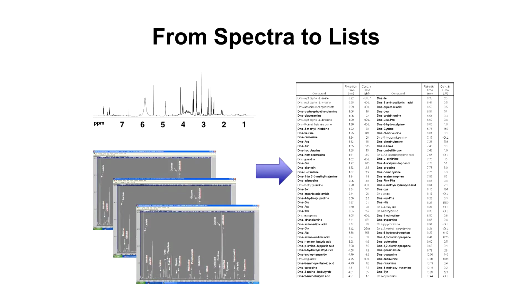So you can break down metabolomic analysis into sort of 4 steps, whether it's both targeted or untargeted. Typically, the first one with targeted or quantitative metabolomics, as I like to call it, is to go from spectra to lists of compounds. Now, it may be compounds that are identified, or it may be lists of features with their intensities. So if you don't know what it is, at least you can say it's a peak, and it's at this elution time or this chemical shift, and this is its intensity. So it's still a feature, but whether it's lists of compounds and the concentrations, or lists of features and peaks with their intensities, you're still working with lists.